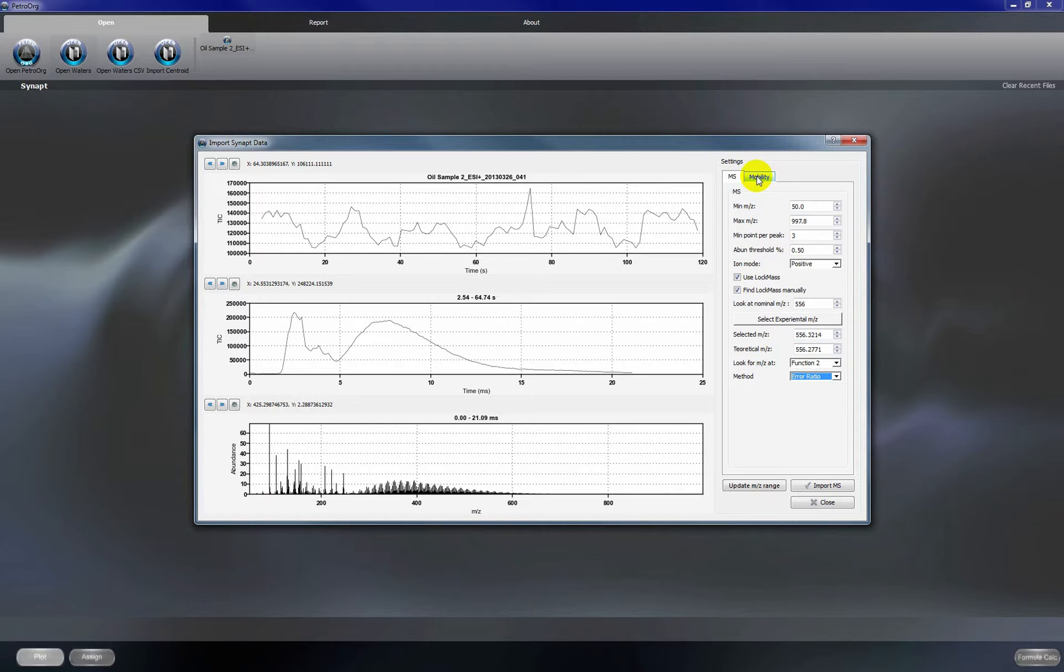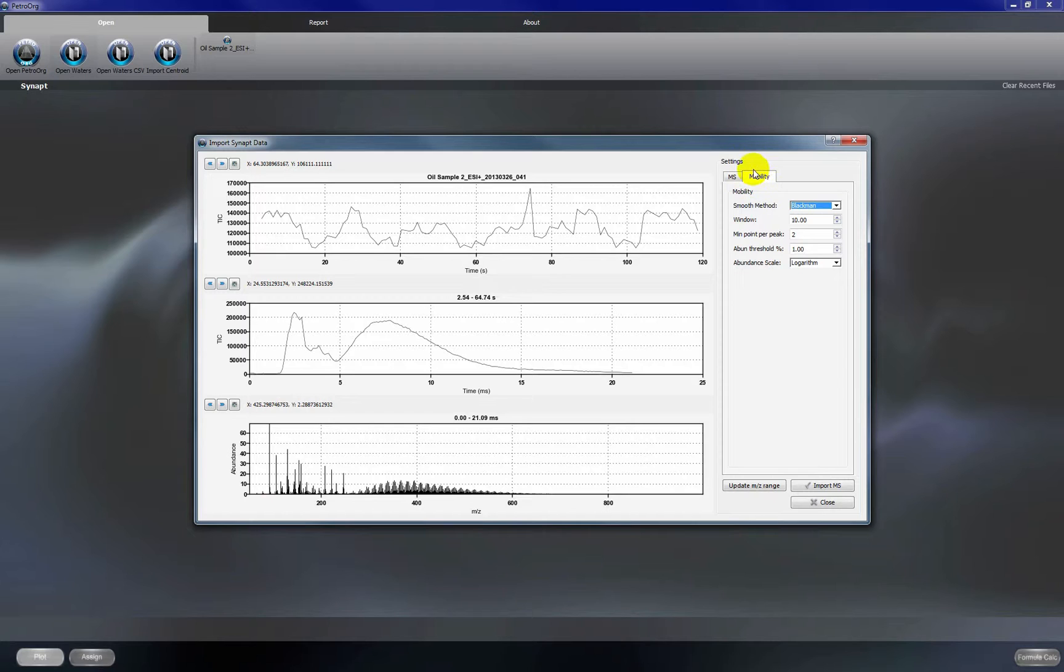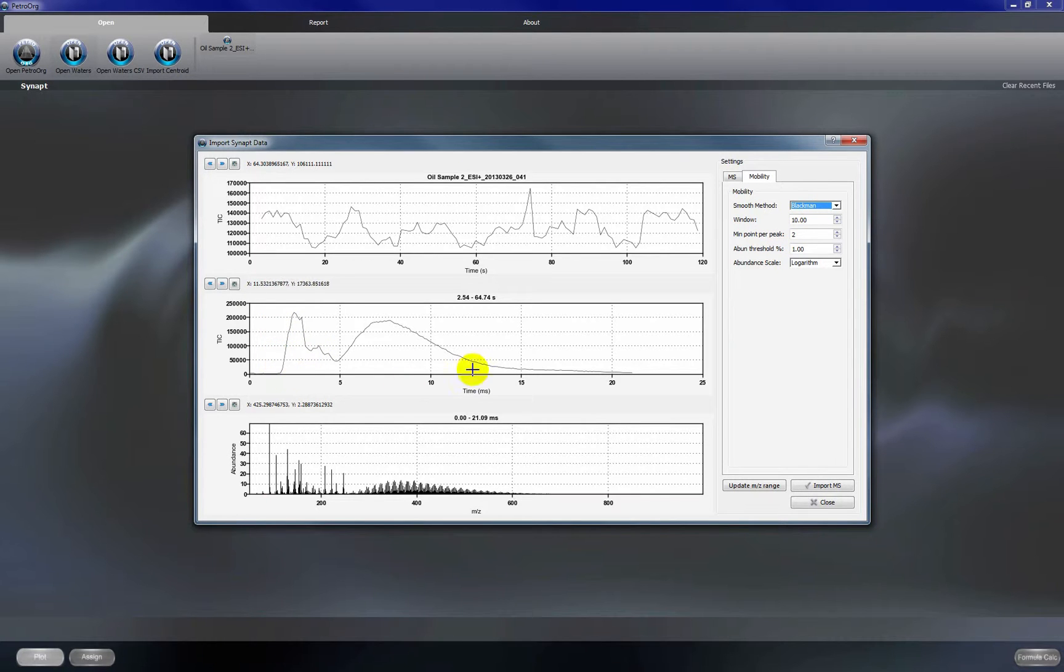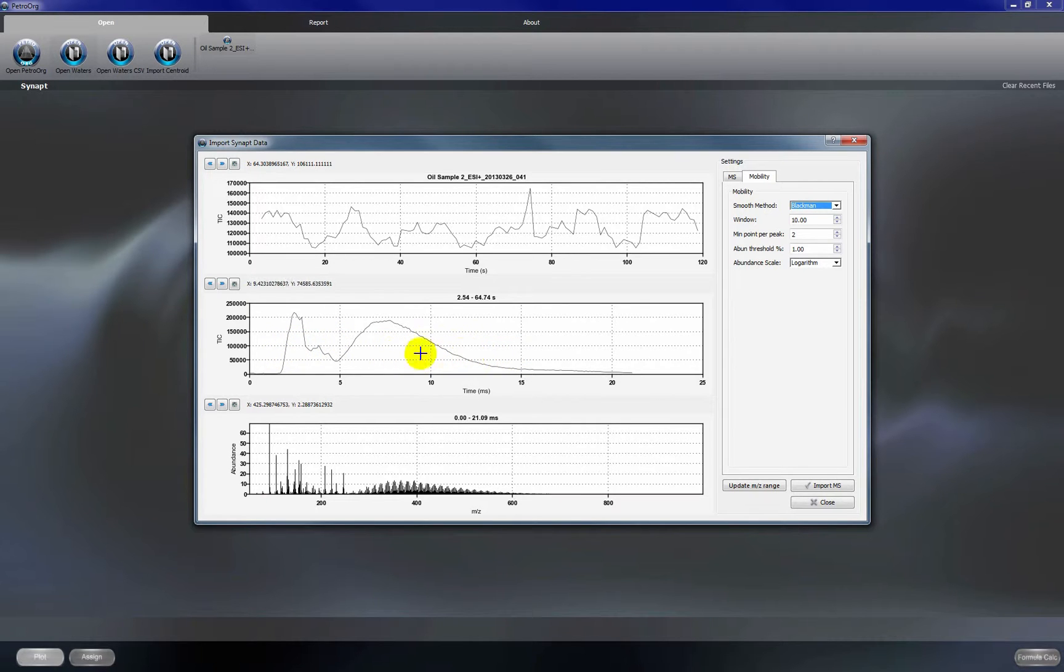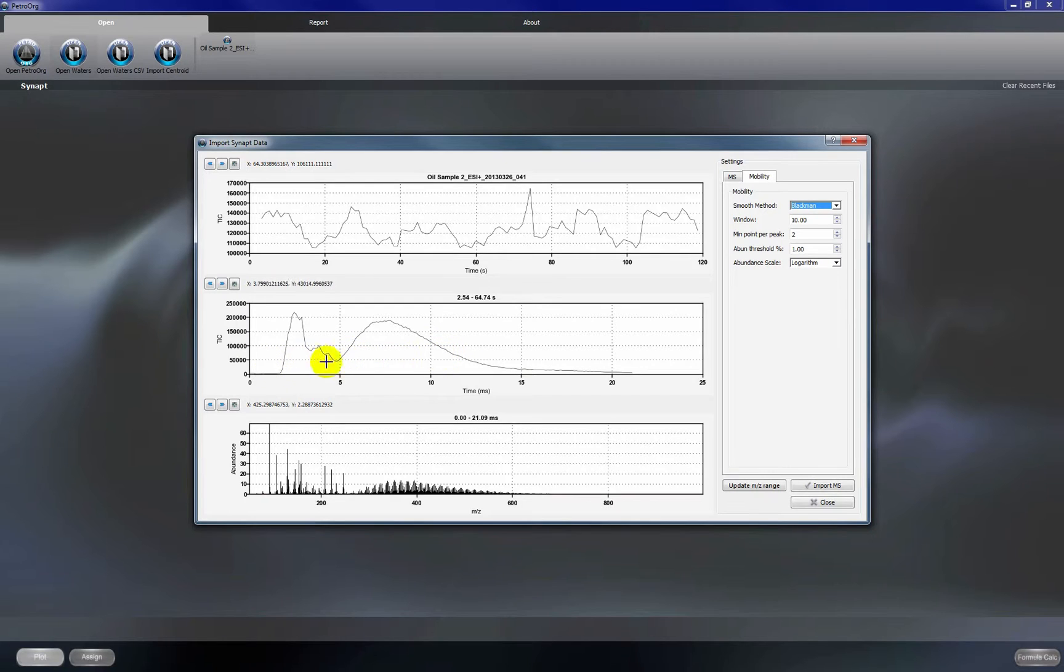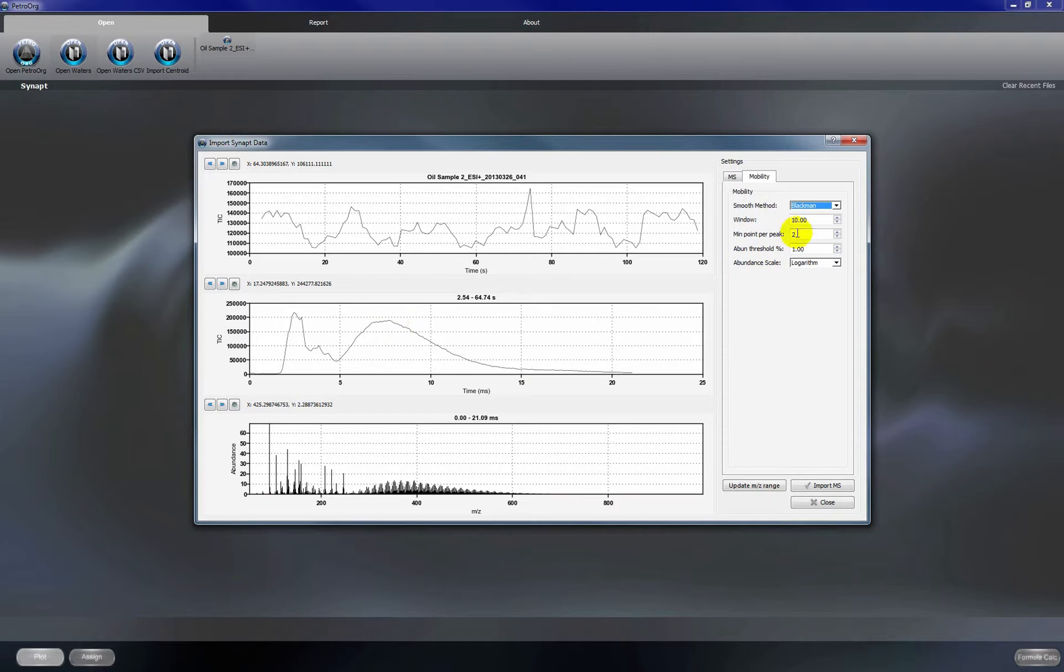In our mobility section, we're going to use the Blackman smooth method. Our window should be about half of the region of your mobility time. So here we've got a mobility time of around maybe 10 or 12. So we're going to use a window of 5. That's just a general rule of thumb.